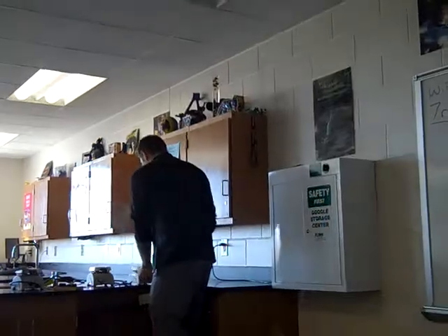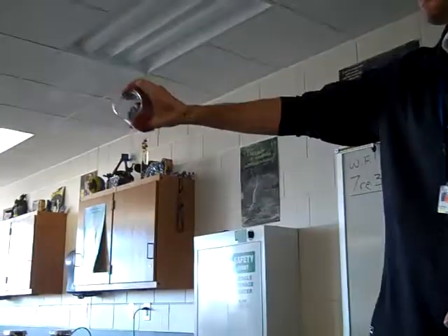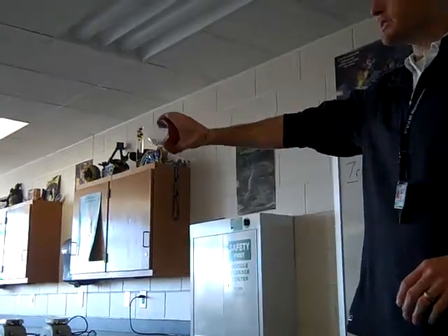So now when I evaporate it, okay, do I have stuff left on the bottom of the beaker? Yes. Is the water all gone? Yes. So was I able to separate the water from the sugar? Yes. And if you smell that, that's what's happening. That's the sugar burning. If you've ever burnt sugar before, it smells kind of good, but then after a while, it doesn't smell very good because it starts burning. Can we all smell it?